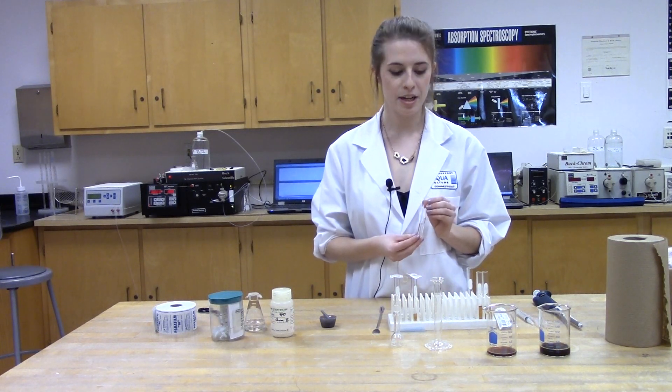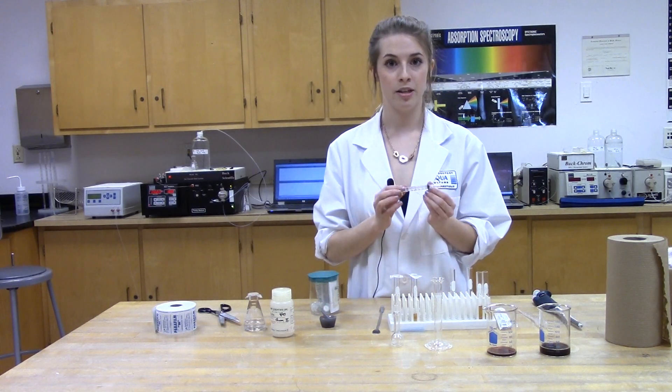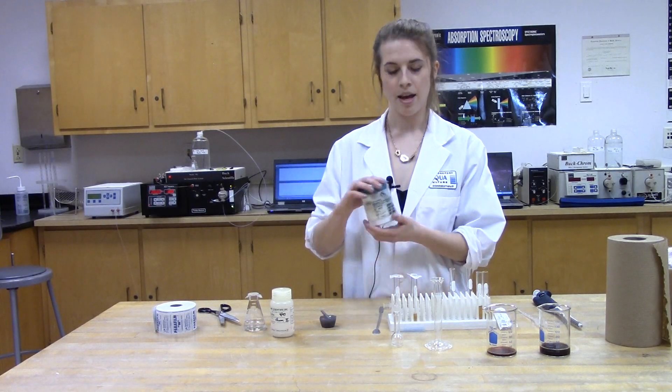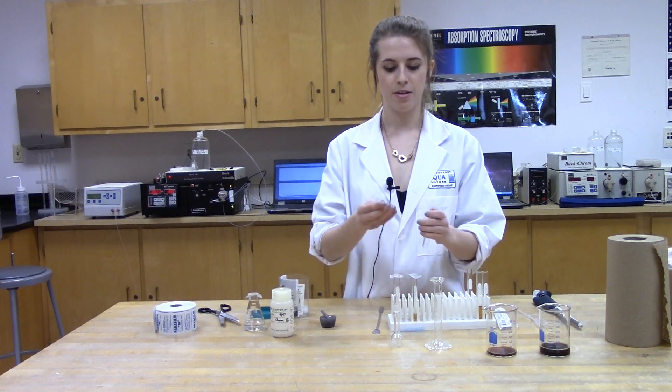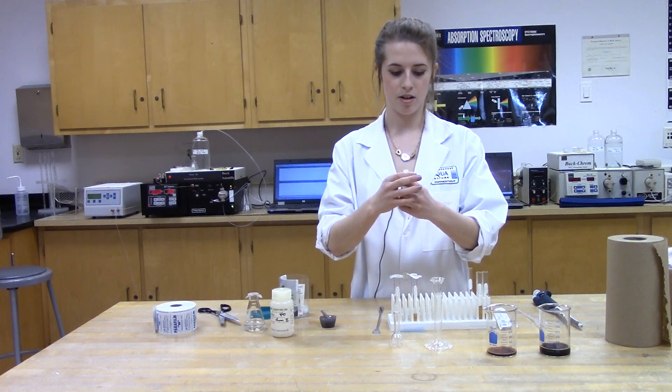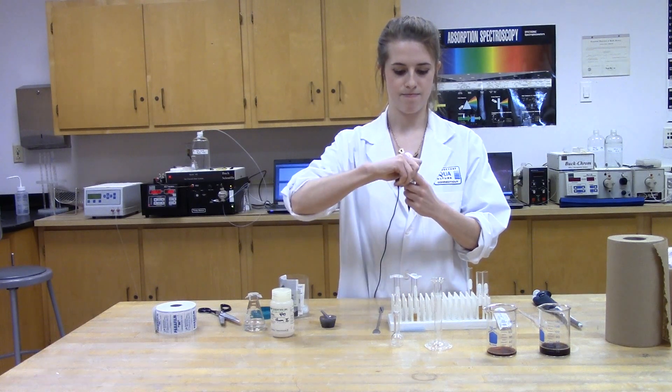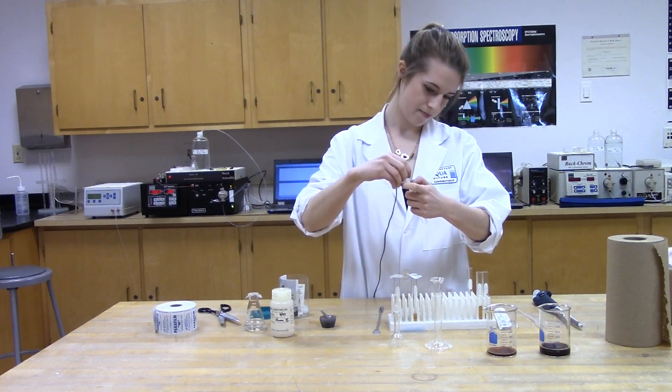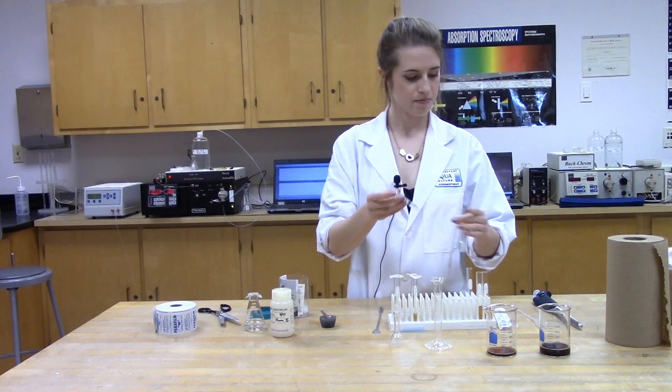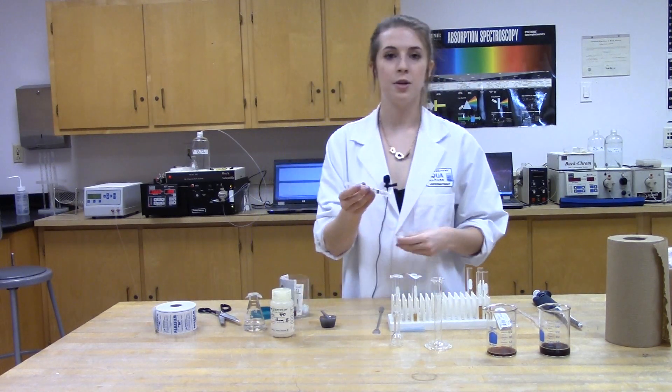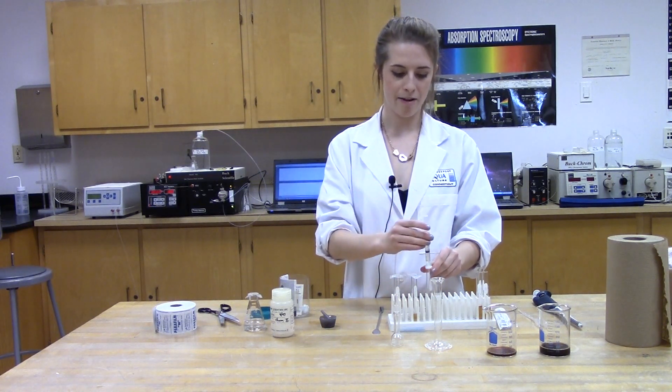To ensure it's high quality enough to run through the instrument, we're going to filter it. We can use a three milliliter syringe and the filtering pads. The first step is to fill the syringe with the caffeine and mobile phase mixture. For the HPLC, you only need a small amount.